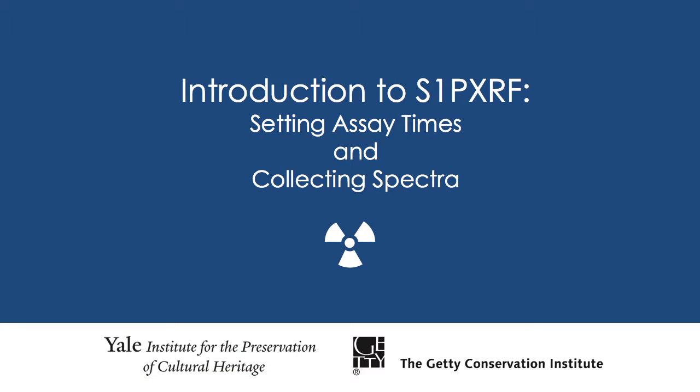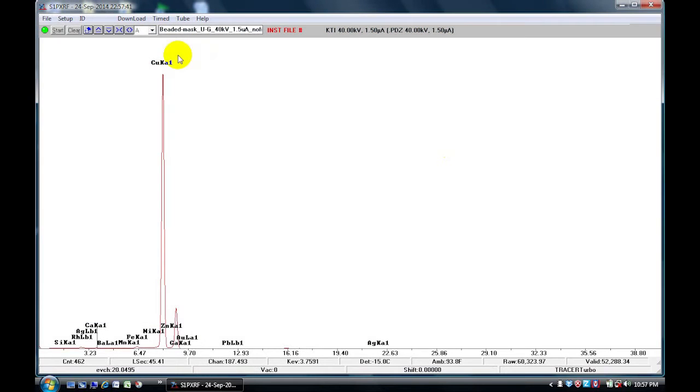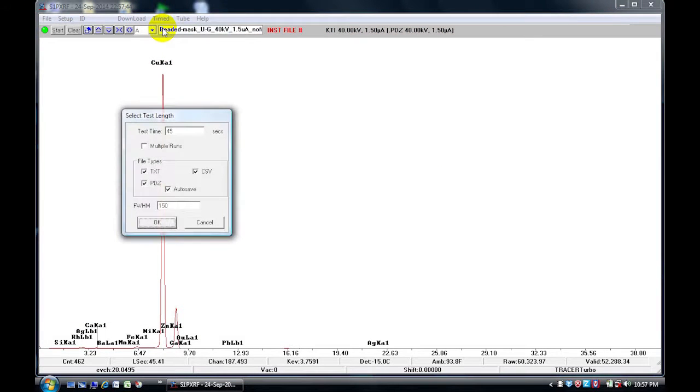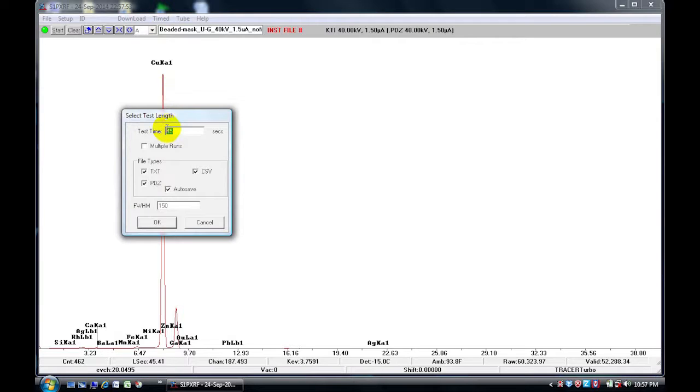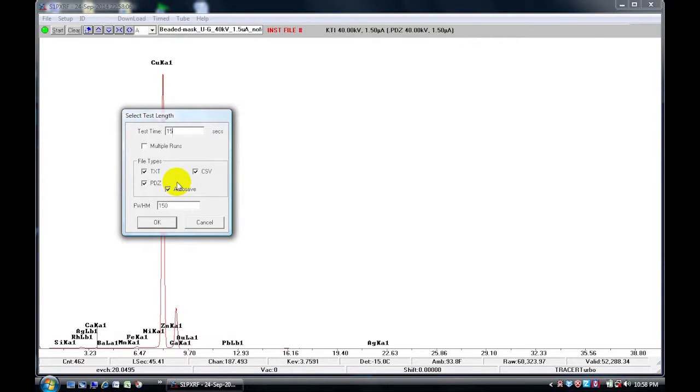In the next section, we are going to do timed assays. We go to timed and click on timed assay. We can choose the acquisition time that we would like. For this demonstration, I will put 15 seconds. We have the three different file types. The PDZ file type is the proprietary S1PXRF file type. The text and the CSV file types can be opened with Grams, Excel, or the RTEC software.